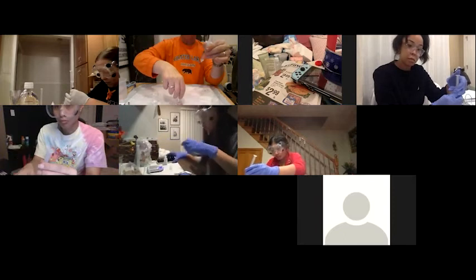Color and gone. So you see it's disappearing rather quickly. So that means I'm not particularly close to the end point. So I can continue to add about 4 or 5 drops at a time and swirl and it disappears quickly. But when it starts to take a couple seconds, then you're really close.